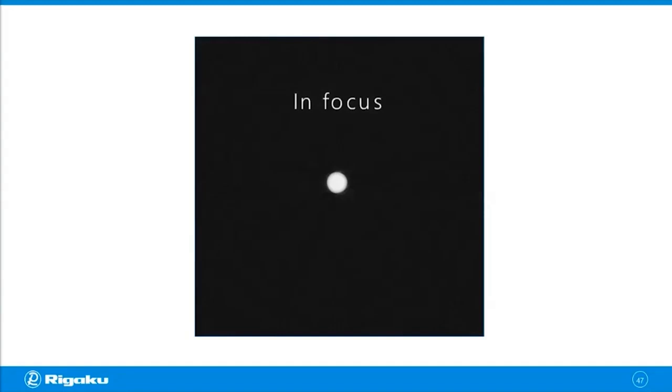And this is easy to do when you have an image like this one. It's really simple. And it can be a little bit more tricky if you have a complicated structure. So I want to show you another example.